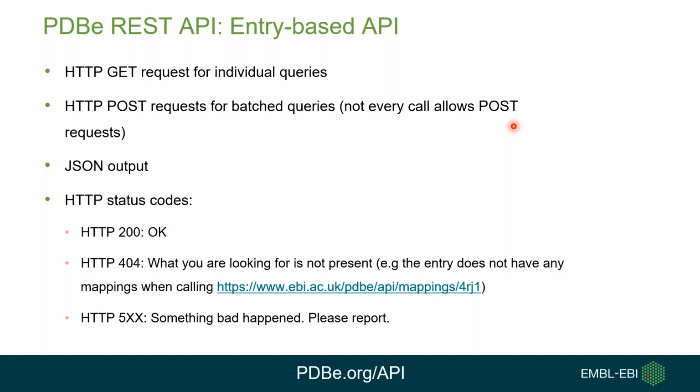Let's take a look at the details of the entry-based API. Both HTTP GET and HTTP POST requests are allowed, GET for individual queries and POST for batch queries. Not every call allows POST requests, however, the majority do. The output is in JSON format.